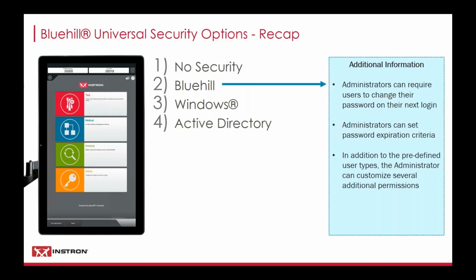If you're using the Bluehill base, the administrator can require users to change the password on the next login. Administrators can also set password expiration criteria. And in addition to the predefined levels, the levels that are predefined by Instron, it's the operators, the lab manager, and the administrator. The administrator can also customize several other more minute permissions.